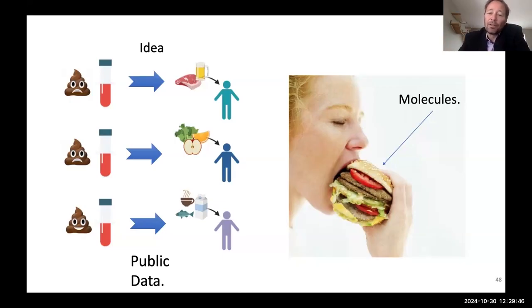And so if that holds true, that means that dietary signatures must be present in these clinical samples. And so if that's true, then we should be able to get some sort of diet information from the molecules that are detected in these particular samples. But again, the majority of molecules remain unannotated, particularly food-derived molecules and microbial-derived molecules. They are not yet annotated because people haven't investigated those sufficiently.